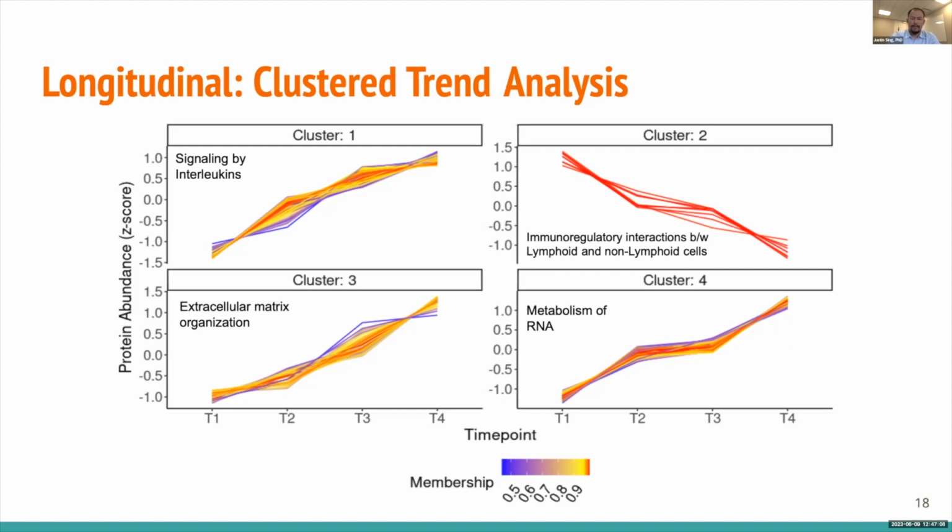By combining the identification of the overarching pathway of interest with these clustered temporal profiles, we can uncover the complexity and heterogeneity of Vanessa's proteomic landscape. This integrated approach enhances our ability to decipher the intricate interplay of proteins and pathways involved in her longitudinal profile.